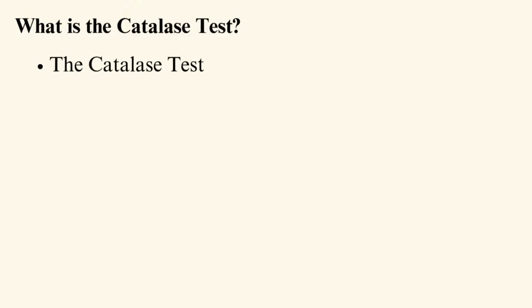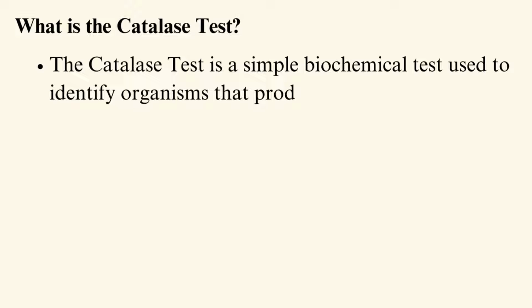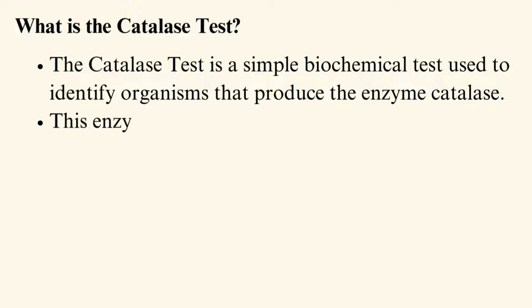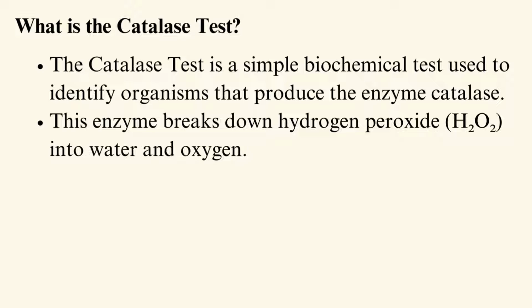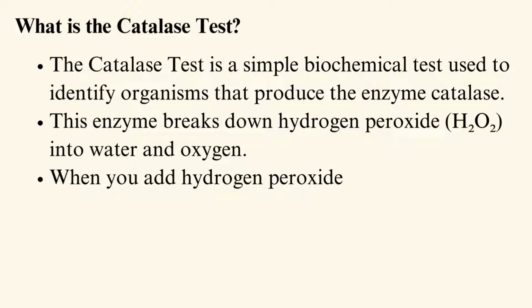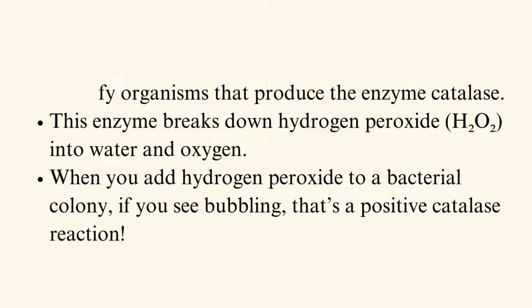The Catalase test is a simple biochemical test used to identify organisms that produce the enzyme catalase. This enzyme breaks down hydrogen peroxide into water and oxygen. When you add hydrogen peroxide to a bacterial colony, if you see bubbling, that's a positive catalase reaction.